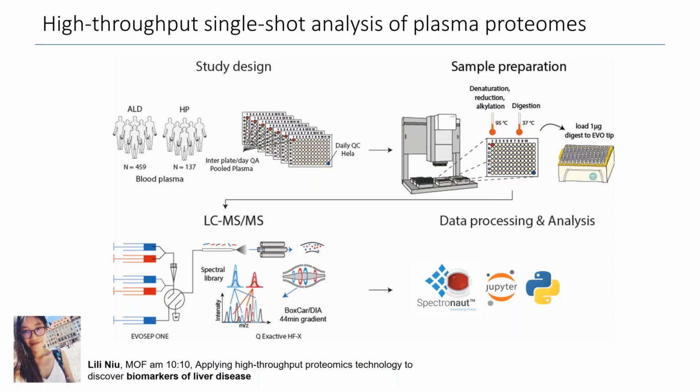But I think it really shows how far the technology is these days, and we're really in a position now where we can start applying our technology to find new biomarkers. So this was great.